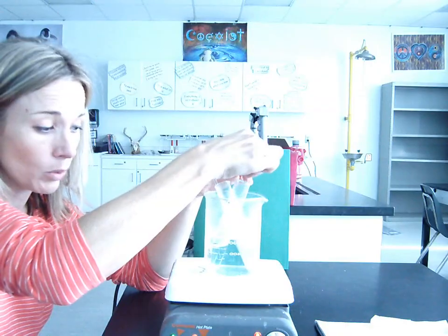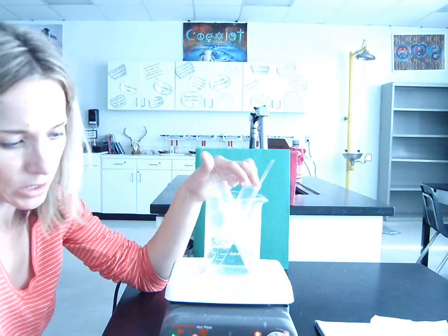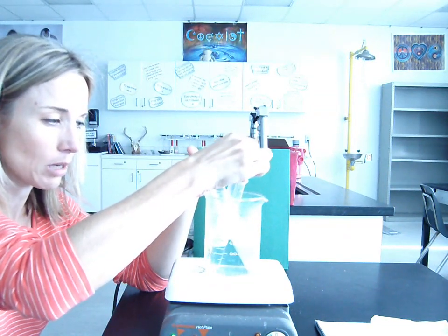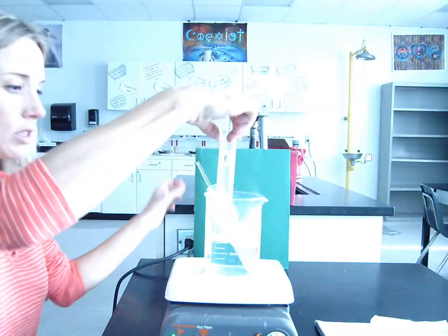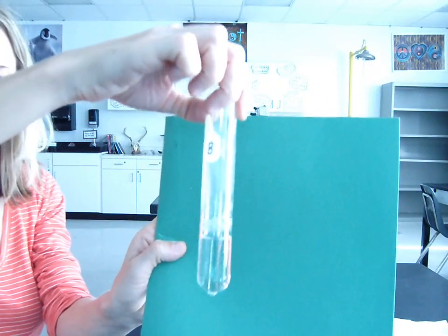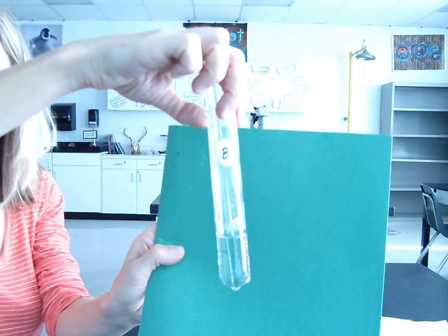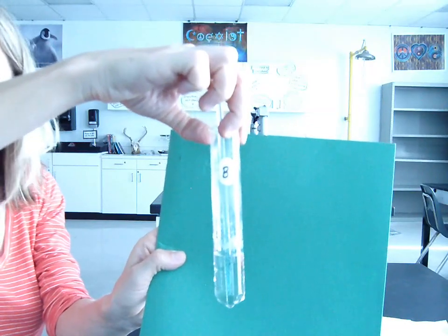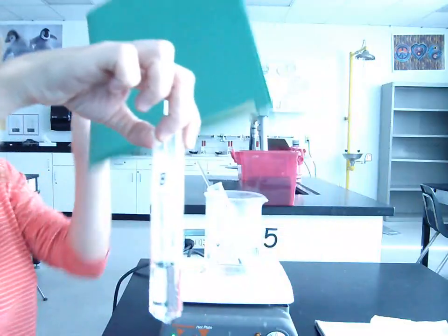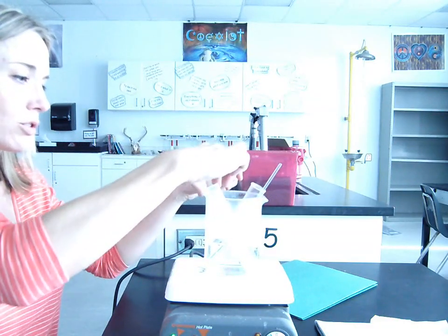Okay, well, so what we can tell right off the bat, just based on observation, is that whatever substance B is, its solubility in water is definitely affected by temperature. So substance B, let's see if we can see that, is totally dissolved, every last bit of it. So the solubility of substance B increases as you heat it. The hotter it gets, the more soluble it becomes. Okay. I'm going to put this back in here for just a second to show you substance A.